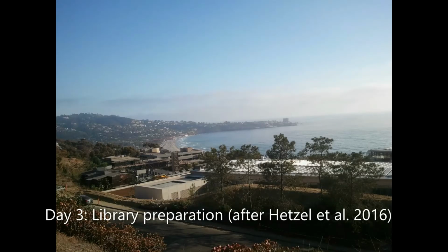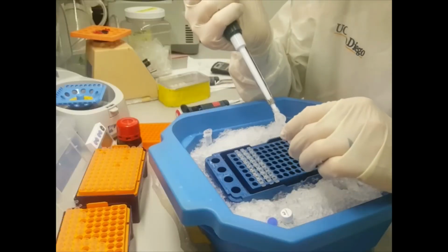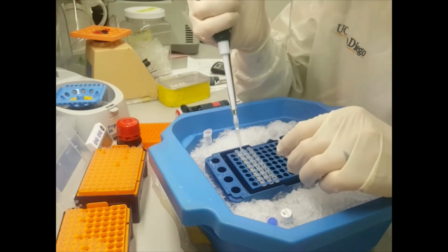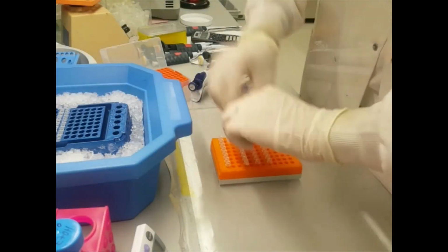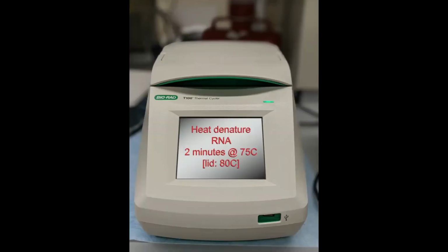Good morning! Well, now that we have both 5' enriched RNA, which I will refer to as csRNA, as well as the input RNA, or the whole small RNA, we can start with the library prep. If you haven't already done so, resuspend the csRNA-seq pellet. To do so, I would pipette 3 microliters of TET into PCR strip lids, and then simply exchange the lids, as done so many times before. Make sure the RNA is nicely resuspended.